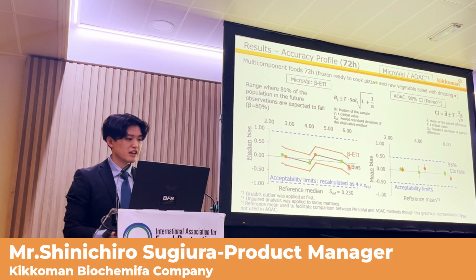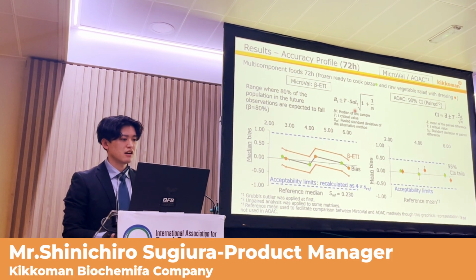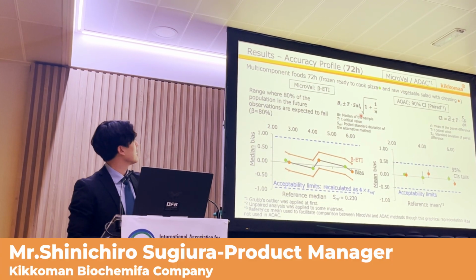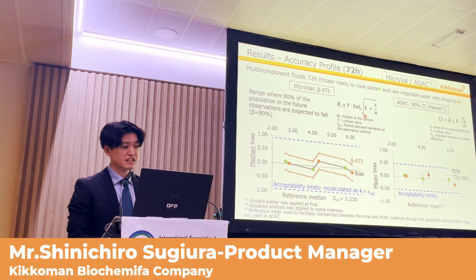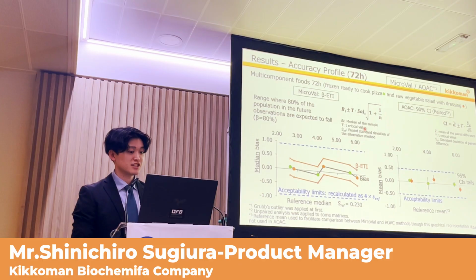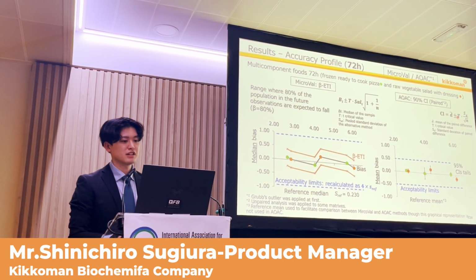And beta ETI is fixed as a category and tends to be wider because it uses the standard deviation of alternative method, and this standard deviation is pooled for the category, and it doesn't account for the pairedness of the study. Compared to this, confidence interval uses the standard deviation of the paired difference, so it accounts for the pairedness of the study.